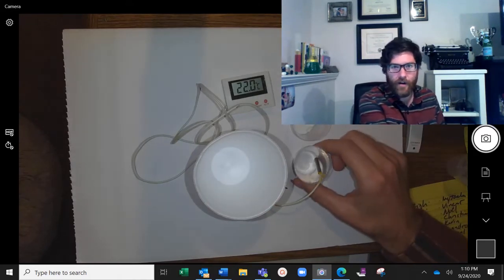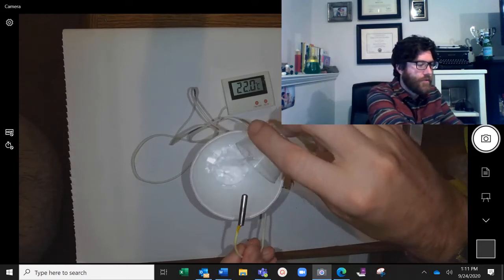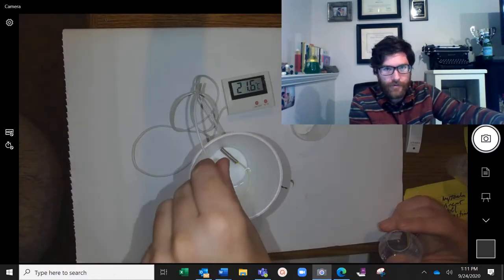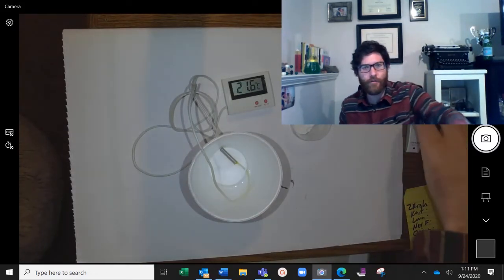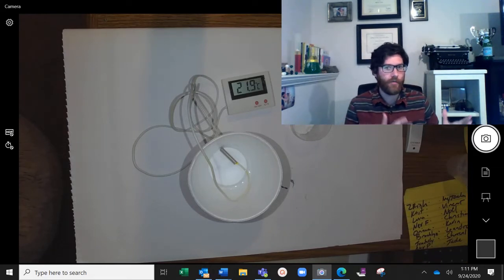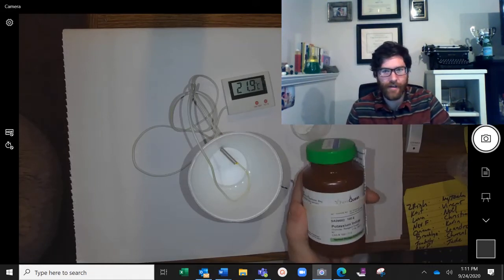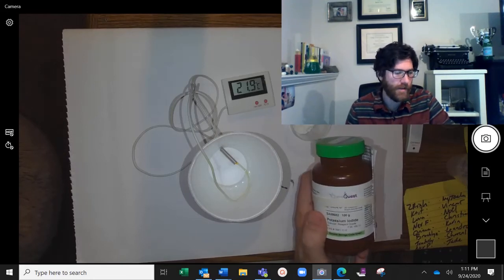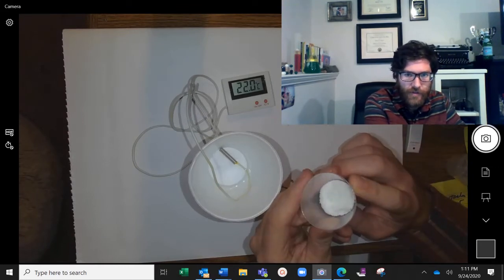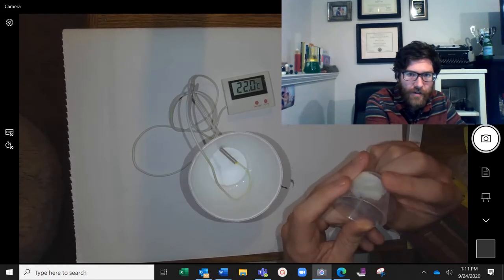So in here we have our hydrogen peroxide, and I'm going to go ahead and add that liquid to the cup and take its temperature. Make sure you record that temperature and make sure that you think about the properties that you can observe about the hydrogen peroxide. Now, the potassium iodide is definitely a substance you probably have never seen or dealt with before. It's a lot like salt. It's kind of this granular white material.